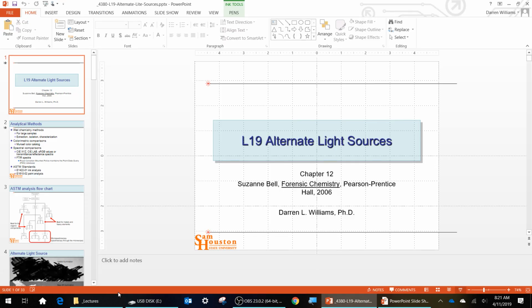And you can use it to image. They have fluorescent fingerprint dust, and we use that in the quality cleaning workshop to teach people how to clean desktops and countertops, and good wiping technique. You just dust a little bit of that powder down, you can track it with the fluorescent light or UV light, and then you wipe the surface and you can see how clean you have it.